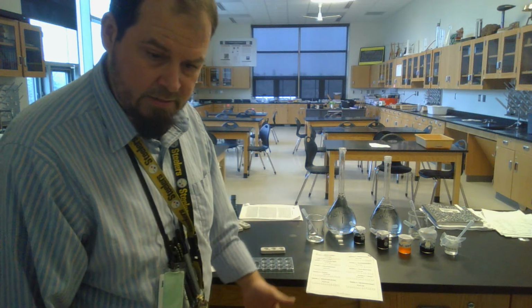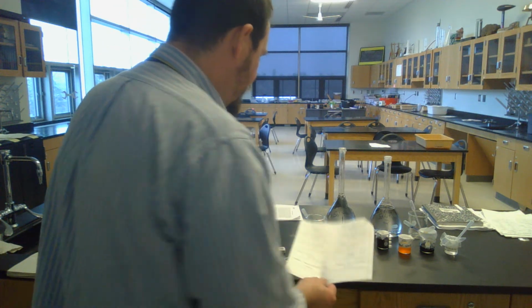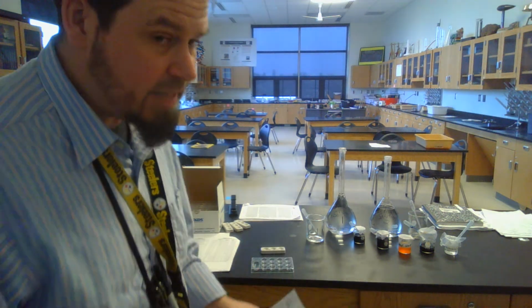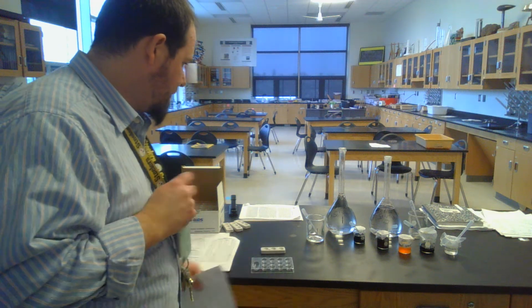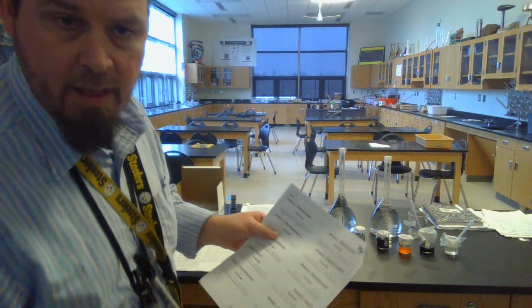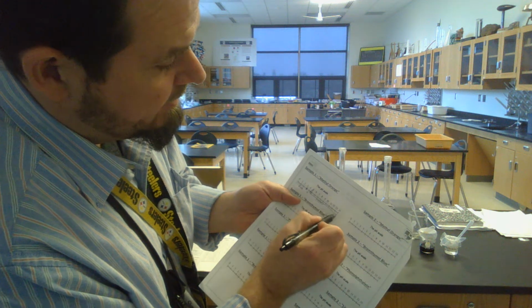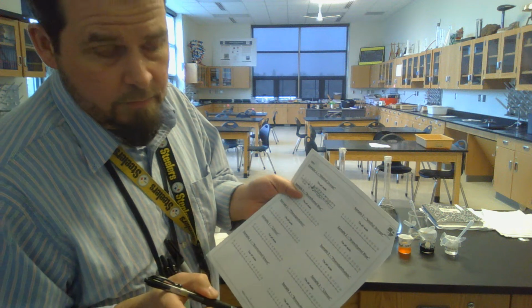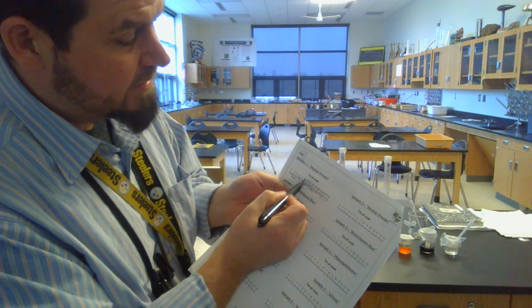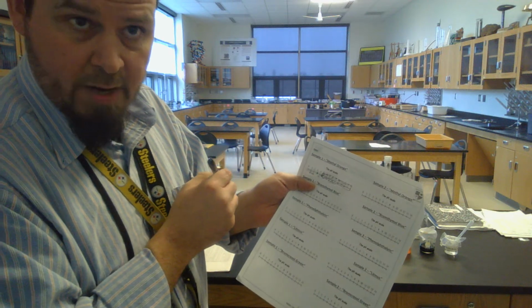You can write your data after each one, and that's fine with me. So I put my methyl orange in there. And let's just say, and I'm making this up because you're not allowed to copy data, I put my methyl orange in solution 1 and it comes up yellow. What I want you to do then is box in this range that is yellow. If it was orange, you box in the middle piece. If it was red, I want you to box in the part on the chart that's red.